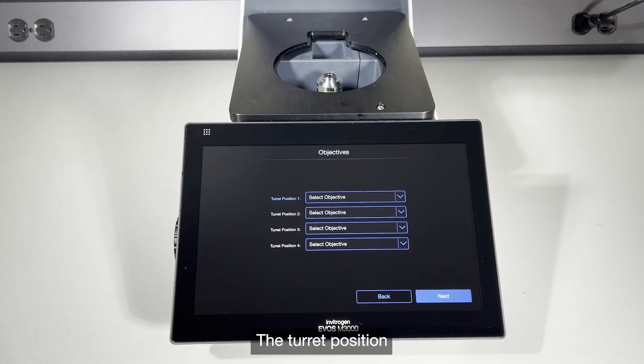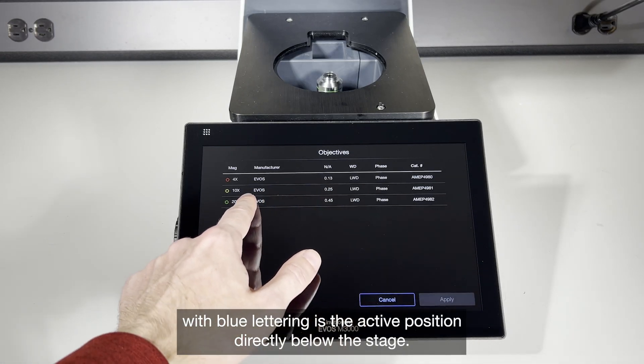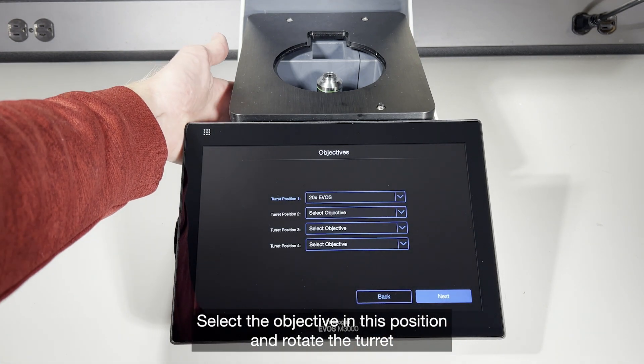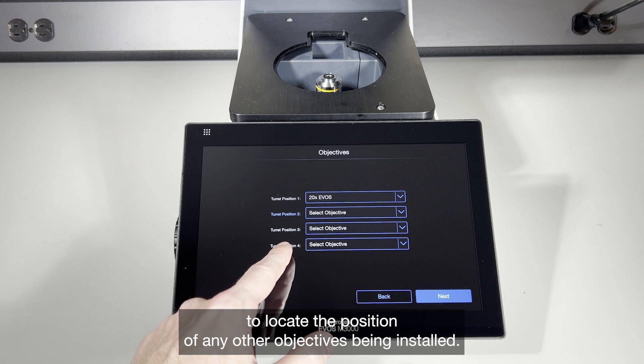The turret position with blue lettering is the active position directly below the stage. Select the objective in this position and rotate the turret to locate the position of any other objectives being installed.